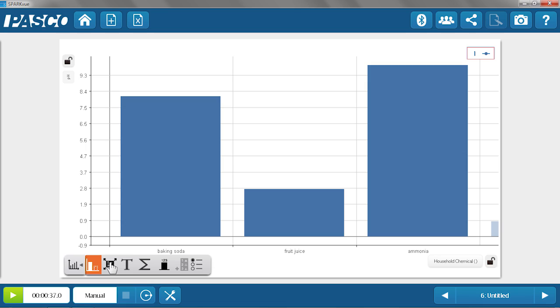So easy to use sensor, connected quickly, a nice experiment that has a lot of applications across grade ranges when you want to measure the pH of various things. In this case we're visualizing it with a bar graph. If you want to see more about this wireless sensor or other wireless sensors go to pasco.com/wireless. Thank you for joining us. Bye.